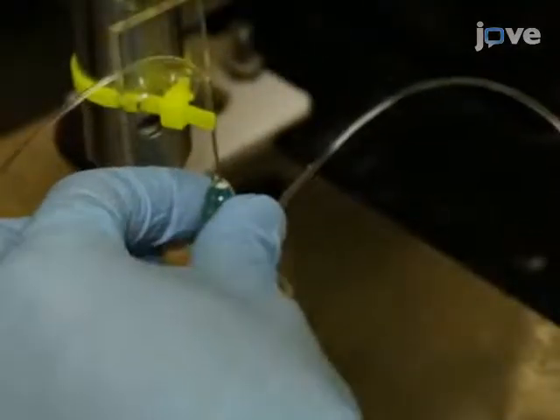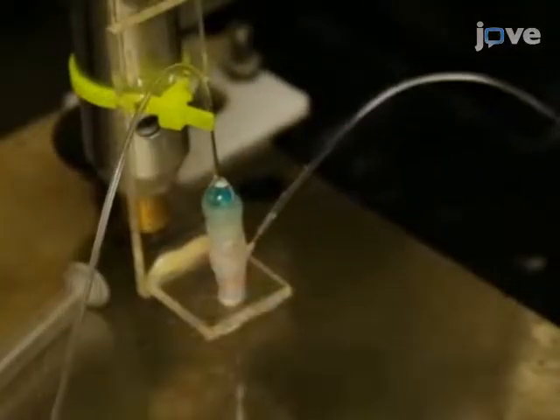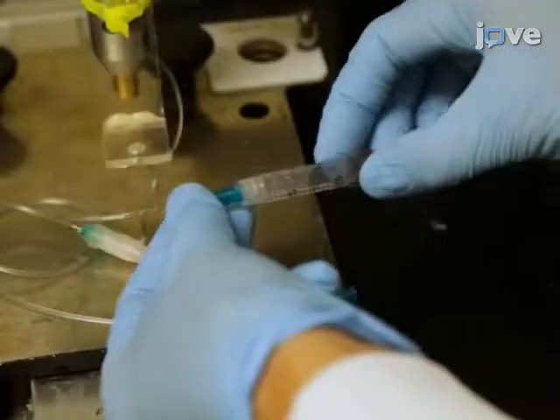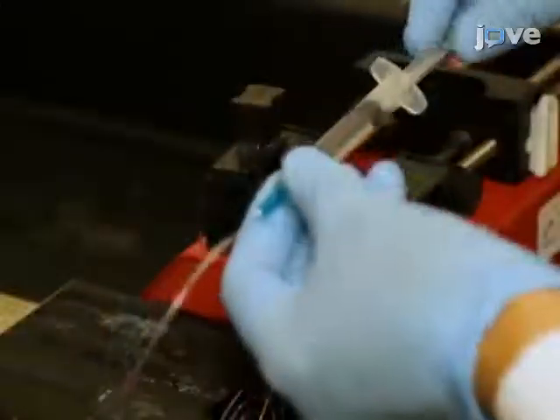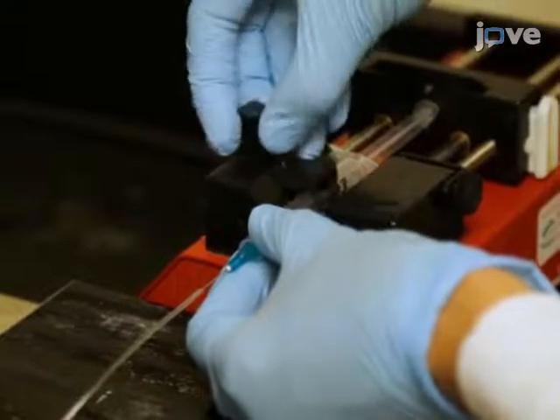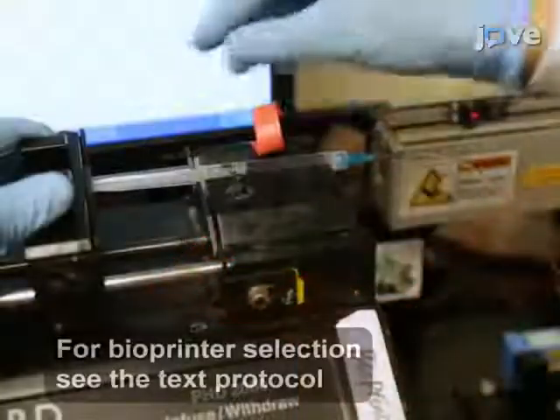Mount the extruder onto the head of a bioprinter using a polymethyl methacrylate or PMMA holder. Next, for injection of the bio-ink and the cross-linking solution through two PVC tubes individually, connect the inlets of the printhead to a dual-channel syringe pump.